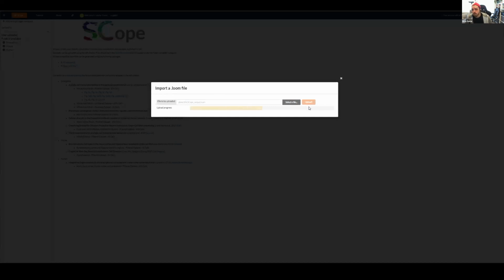In SCope, as a user, you get a free session you can use for 5 days. We clear data after 5 days, just so we don't end up as a repository for everyone storing all of their data, but you can happily re-upload things as and when. There is command line access if you really needed it, but we don't have that very often.